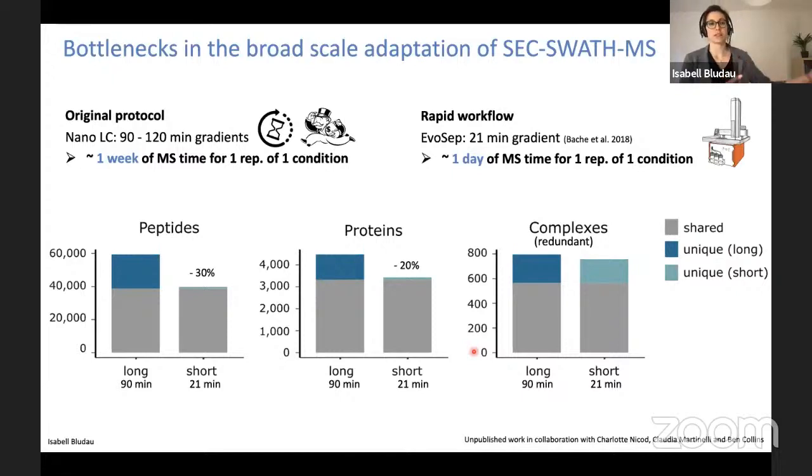And this made this initial comparison between the cell cycle stages extremely expensive in terms of time and, of course, money. So the question was whether we can speed up this analysis in any significant way so that we would make the approach more scalable and actually a screening technique.